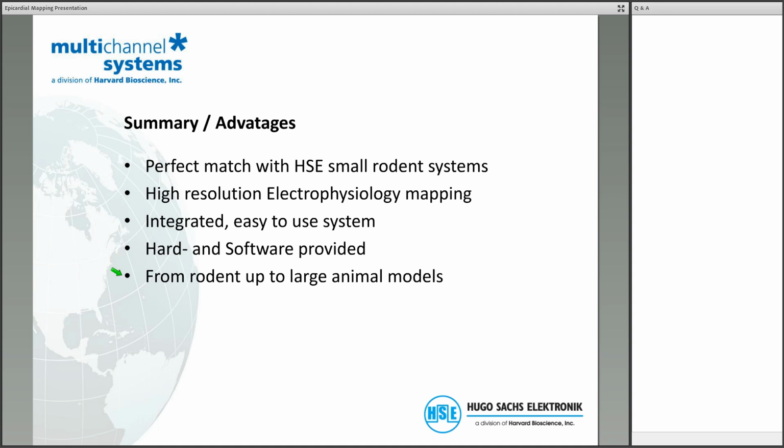Yeah, actually we had a question on how long you would normally record, or how long can you record? Well, the Langendorff heart itself will stay alive for a long time. And if I say long time, it's hours. It is up to 6 to 8 hours. And you can imagine we as a small company have to be cost conscious.